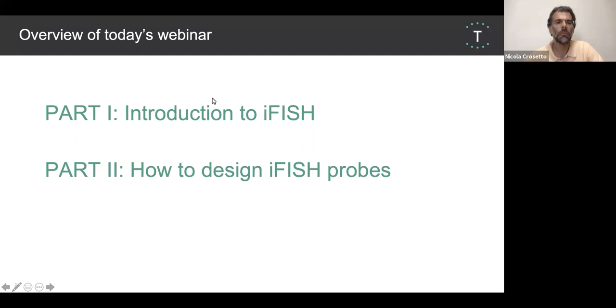Today's webinar is going to be structured in two parts. First, I'll give you an introduction to the IFISH pipeline that I just mentioned. And in the second part, we'll have a more hands-on, virtual hands-on guidance to how to design probes using a freely available web tool that Gabriele developed in the lab.